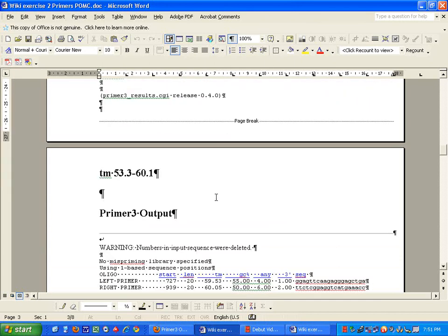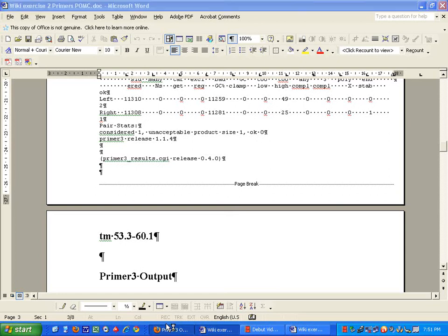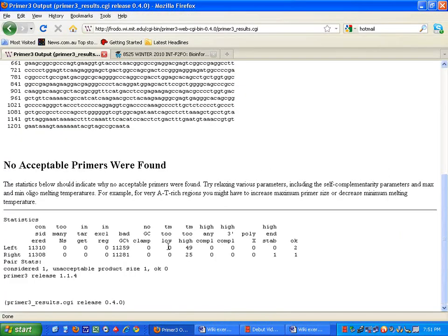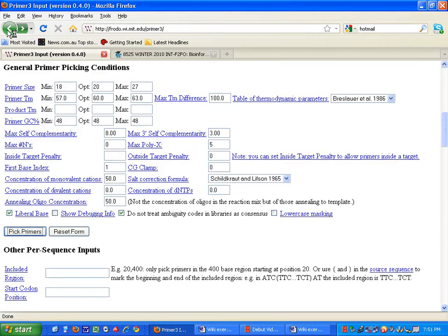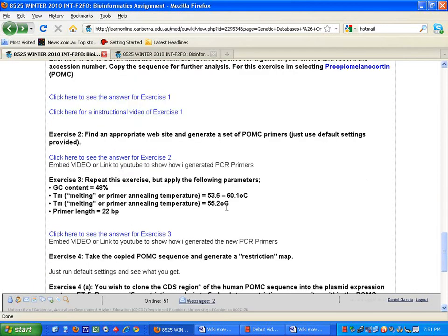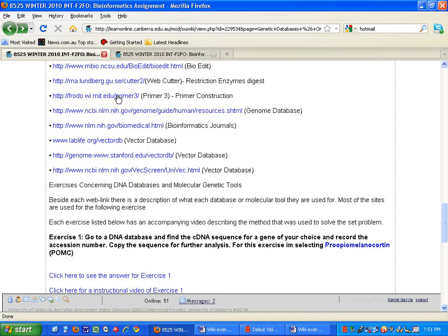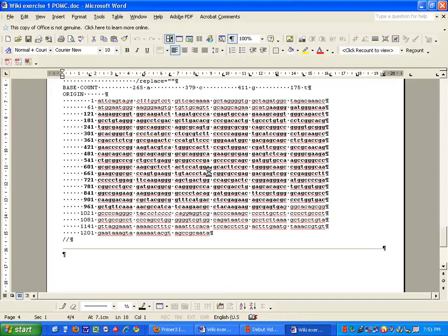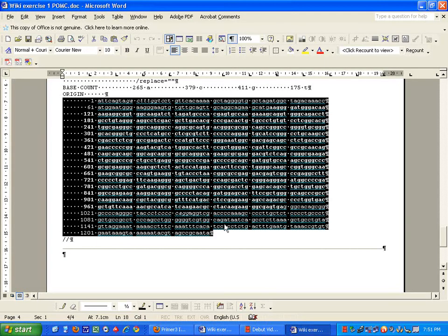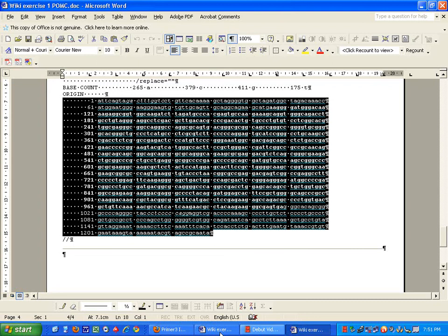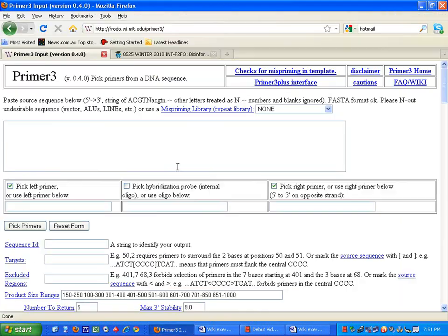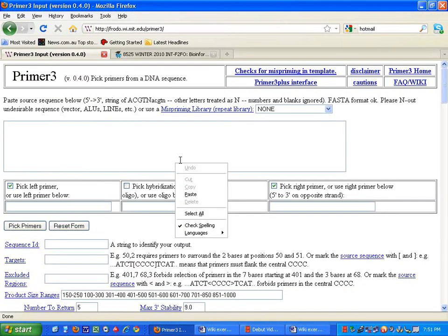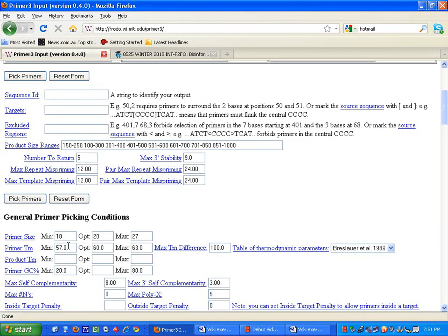Now, on to the second one, which is to have a TM, or a temperature annealing melting temperature of 53.3 to 60.1. Let's double check that. All the way back to the start. 53.6 to 60.1. So, we need to go back to Primer 3, and we need to grab our code that we have here. And we need to paste it into there.